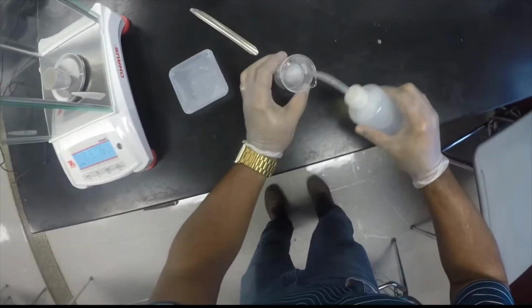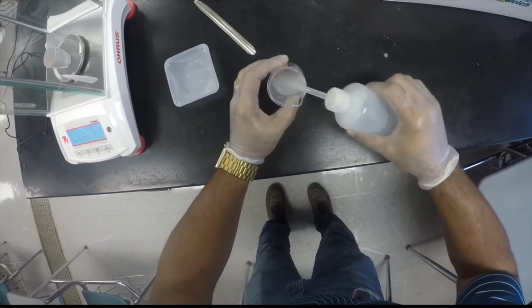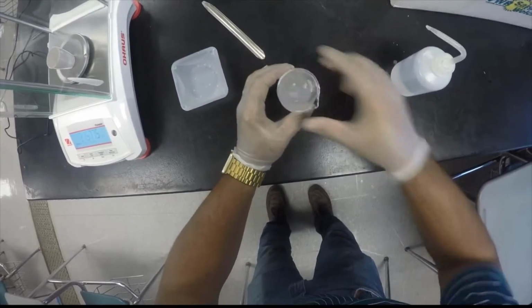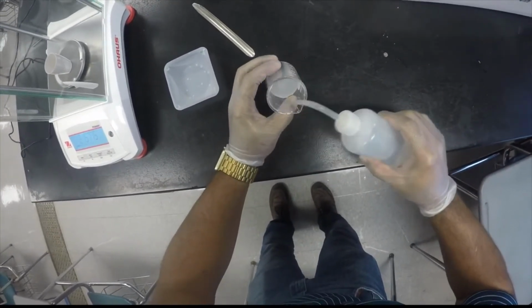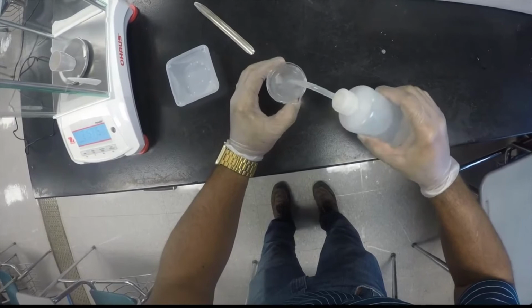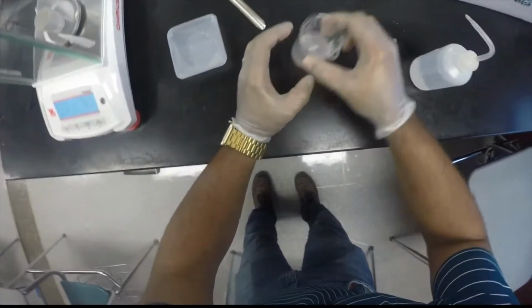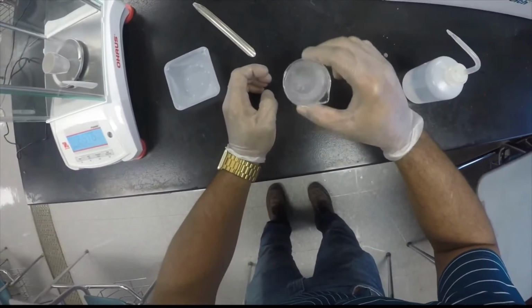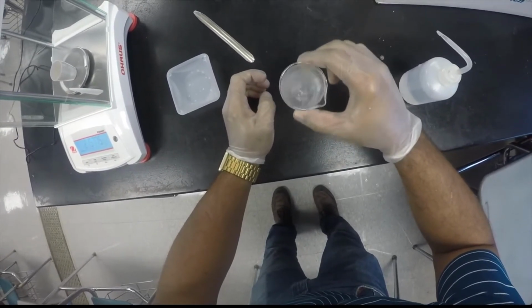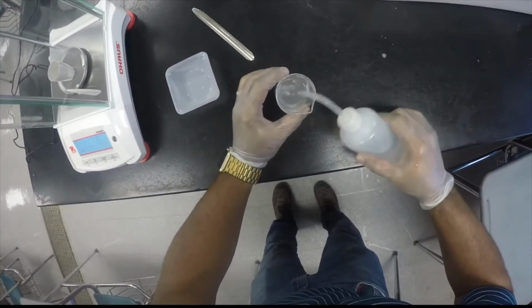And then I'm not trying to be careful to measure the amount of water that I'm adding here, but I do want to make sure that the carbonate does dissolve. By the way, I'm using distilled water for this exercise. We always use distilled water because the water is relatively free of impurities and things that might cause precipitation reactions. So I'm going to give that a good swirl. These group 1 carbonates are fairly soluble in water, so that should dissolve fairly quickly. Almost done. Let me add a little more water.